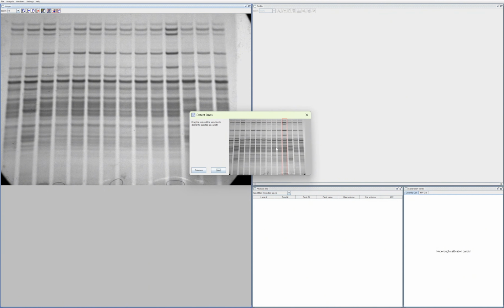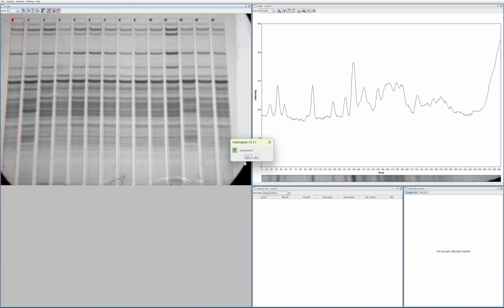For this image, where our lanes are bent, we don't seem to have any consideration of that, so we can only do straight up and down boxes. And I mean, it's done a fine, oh, tilted lanes, hang on. So it's done a good job there. It has done a good job of the lane detection based on that information.